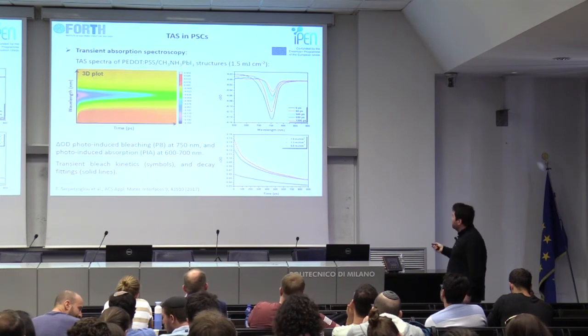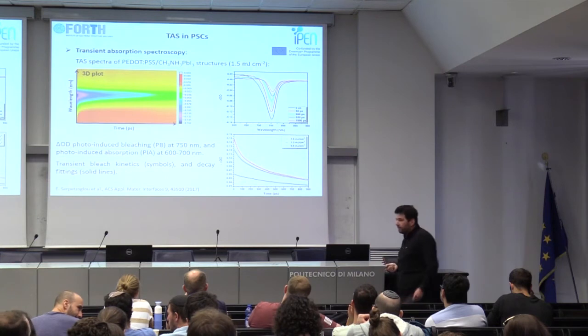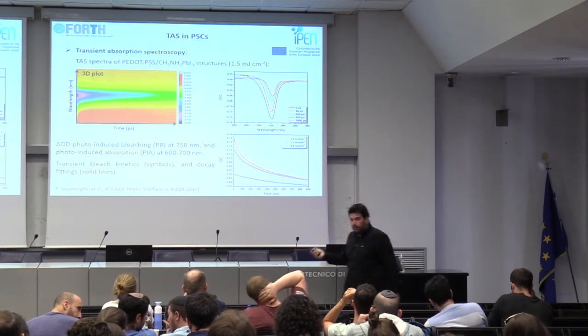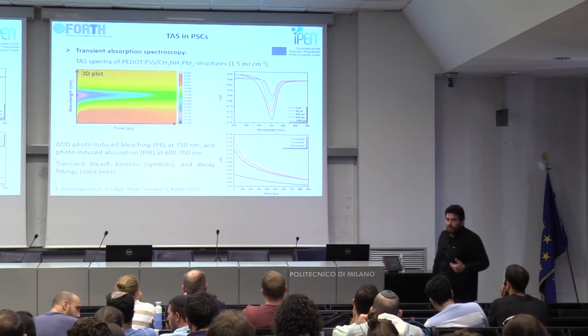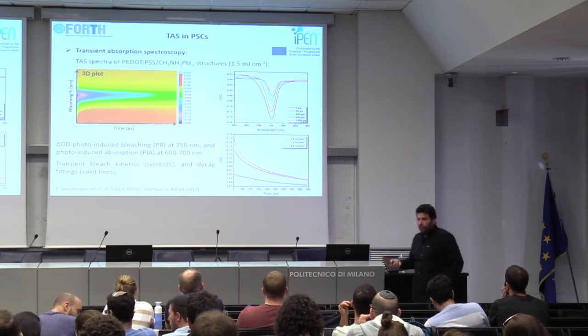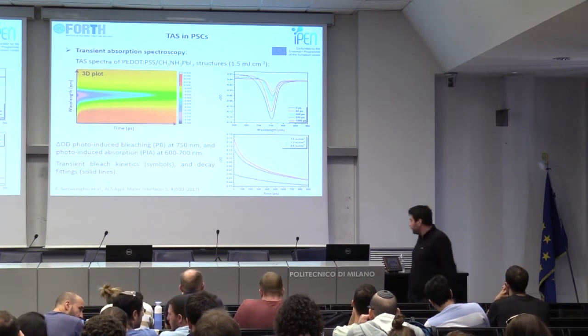Now, as you can see from this plot, the black line represents the photo-induced bleaching with no delay at 0 picoseconds, where as time progresses, the photo-induced bleaching diminishes. And the real information about the charge extraction dynamics comes when we want to study the kinetics of the relaxation dynamics of these decay processes.